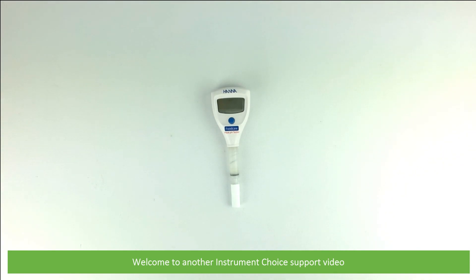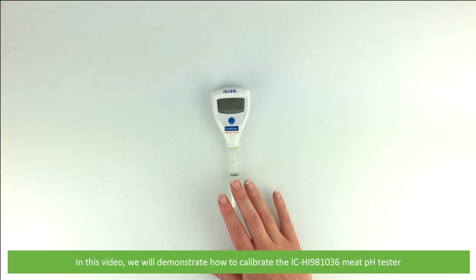Hi and welcome to another Instrument Choice support video. In this video we'll demonstrate how to calibrate the IC-HI-981036 meat pH tester.